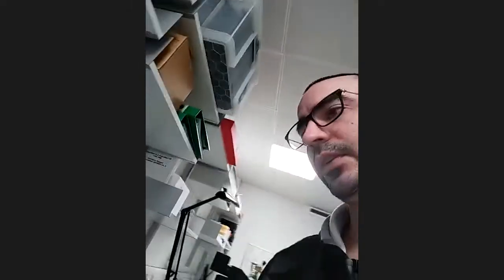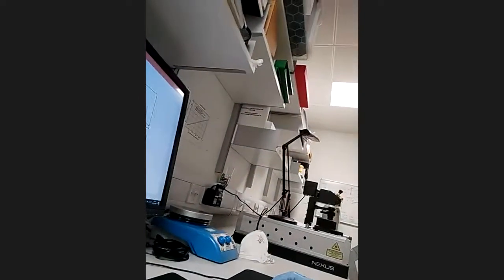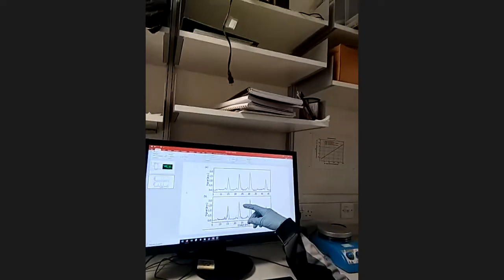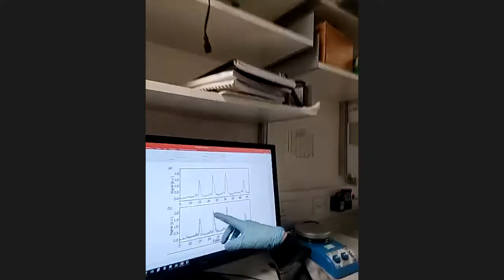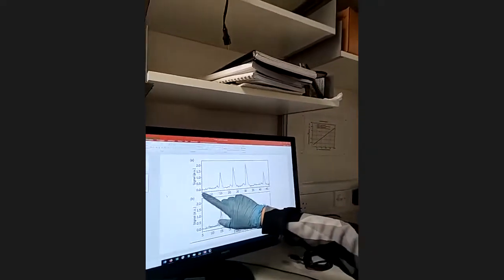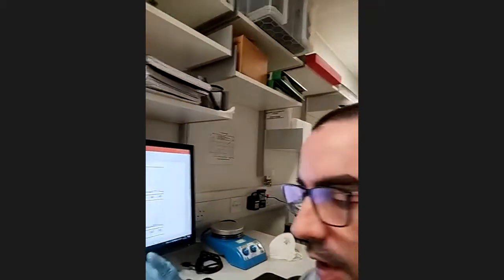And then if I go back to, see, this is where I'm going to try and answer the question, right? So this is results from our latest paper. In chromatography, you would pump samples in, and you're trying to purify something. You're trying to separate things out, like complete vaccine particles from incomplete ones.